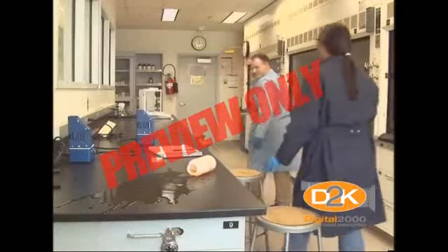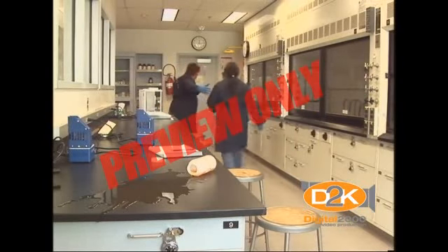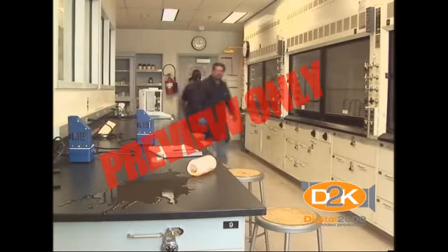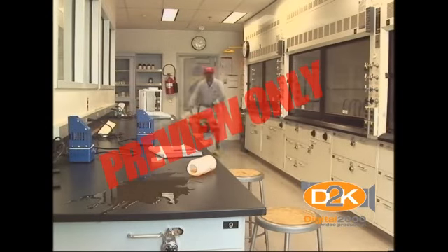If any of these symptoms occur, you should notify your instructor or professor, immediately evacuate the laboratory, and discontinue work until proper arrangements are made to prevent exposure.